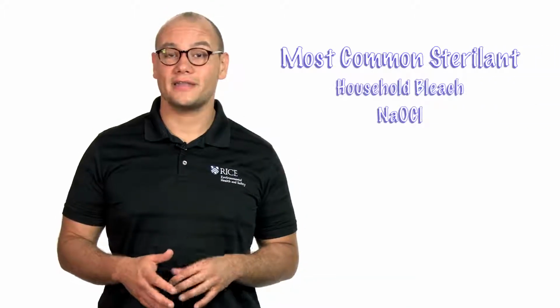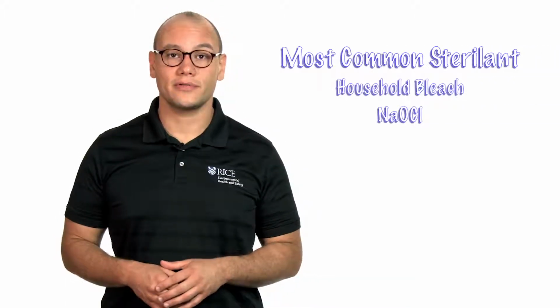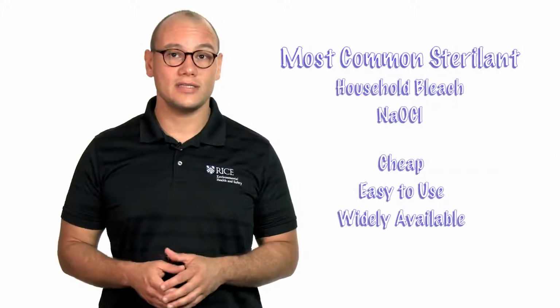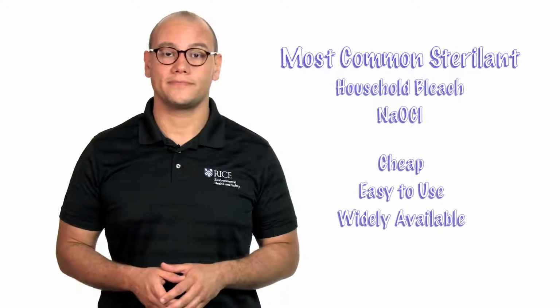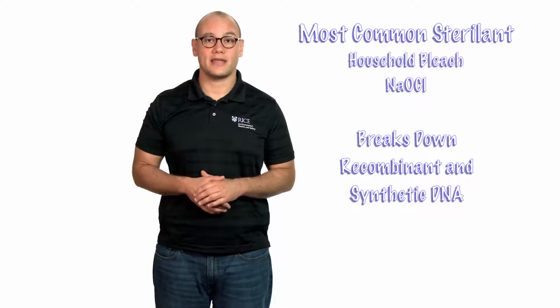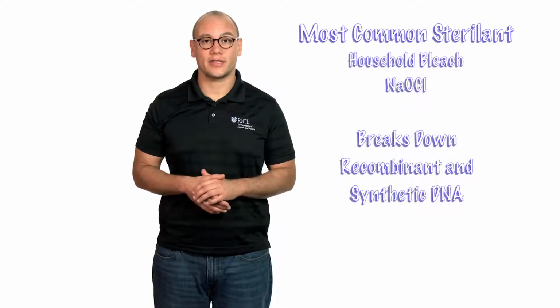The most common disinfectant and sterilant employed in the research laboratory is household bleach, or sodium hypochlorite. It's a great choice because it's cheap, easy to use, and widely available. Household bleach is not only a great disinfectant and sterilant, but can also be used to break down recombinant and synthetic DNA. This makes it perfect for the research laboratory.